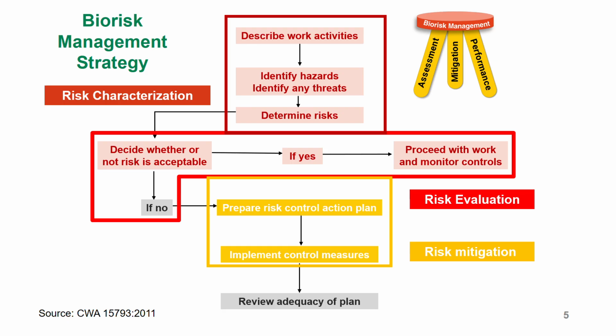You check. So we've redesigned the laboratory. Is this redesigning of the laboratory actually reducing or eliminating the risk of us getting exposed to the Ebola that we're handling in the lab? So you check, are they actually working? Whilst you're checking, you're also looking at the practices. Are people actually using the biosafety cabinet the way they are supposed to use it? Are people using the facilities that have been redesigned the way they are supposed to use them? So under review, you don't just check what you did, you also check, are people actually using the things correctly?